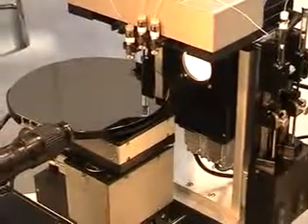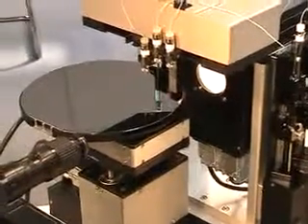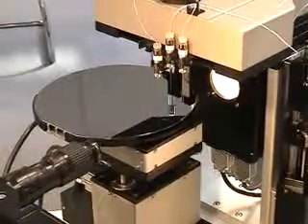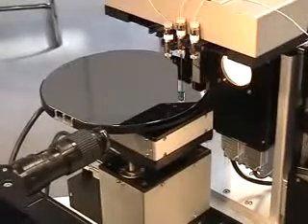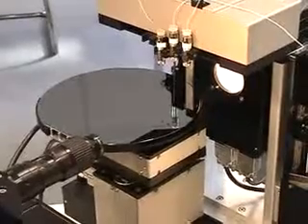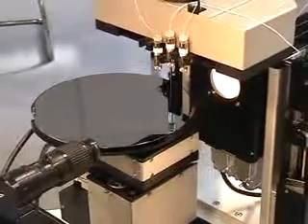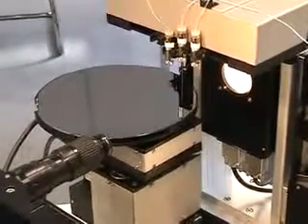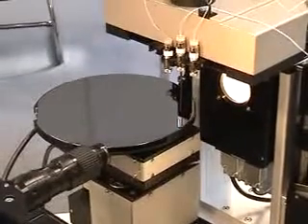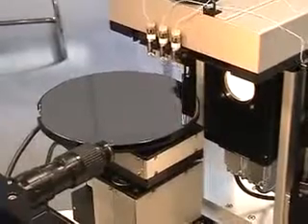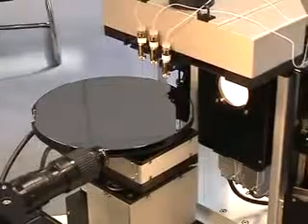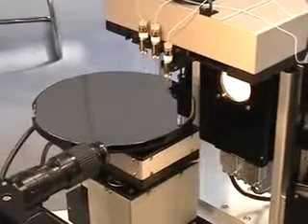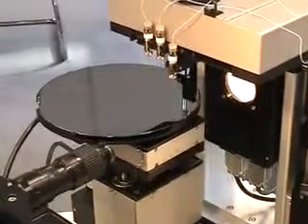Measuring points can be set in line or on a circle, so we have different choices for doing this. Even it is possible to position all the droplets in a complete random manner. What we also see at the moment is that we can work with different liquids on a certain range on the wafer. So this will yield us some values later for the surface energy determination.